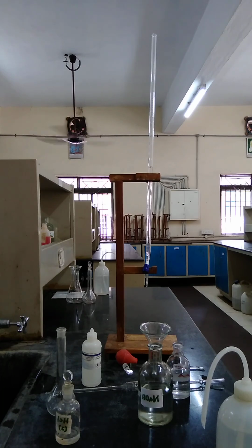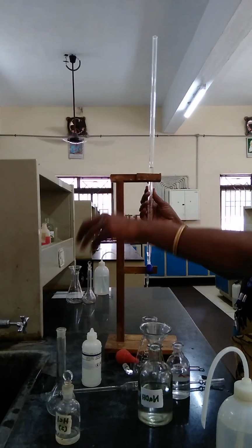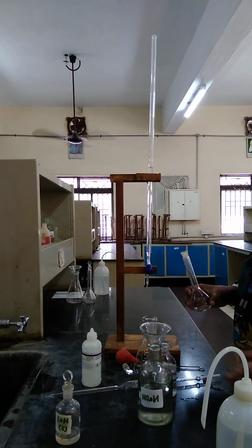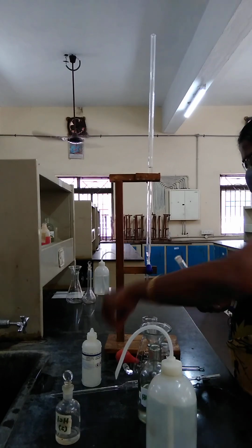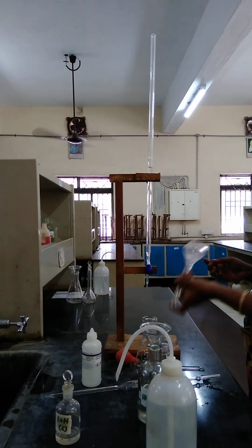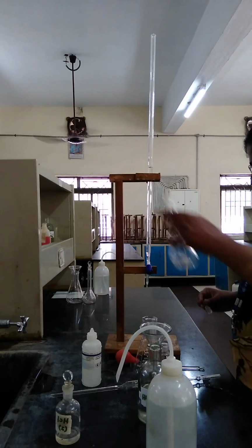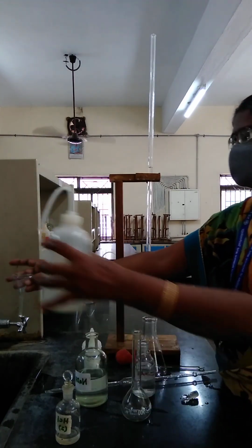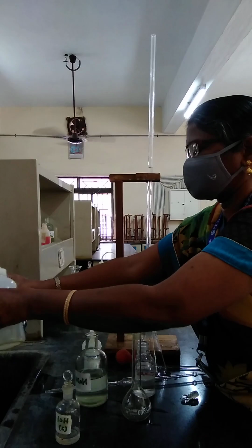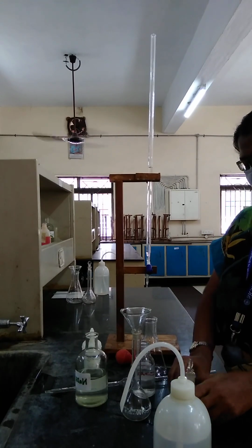The apparatus is getting ready for the next titration. Washing the apparatus, leave it, not to wash. We can refill the sodium hydroxide once again. Now we wash the standard flask with distilled water. Transfer the HCl into the standard flask through a funnel. Then wash the reagent bottle 2 to 3 times with an equal quantity of distilled water. Then we shake the standard flask very well.